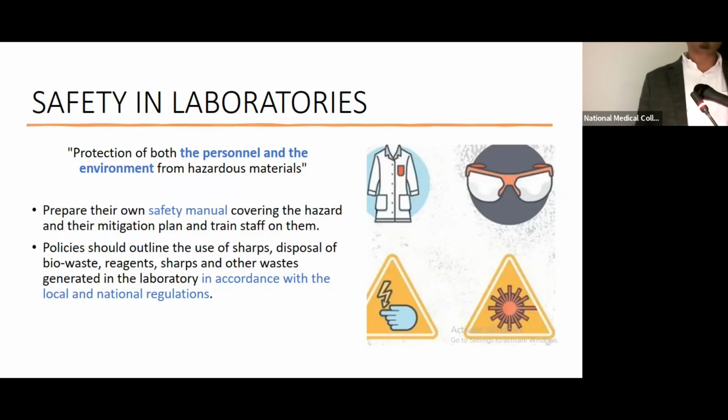However, the guidelines also ensure that there should be safety of the persons involved in testing and of the facility also. So one should take universal precautions, such as proper laboratory personal protective equipment should be available, and the safety manual should be available at the place of use, not locked up in some chamber of someone in charge. The standard operating procedures or protocols to do any particular testing should also be available at the place of work. It is not just for showing during the time of audit. It should be easily accessible for the people who are doing it.